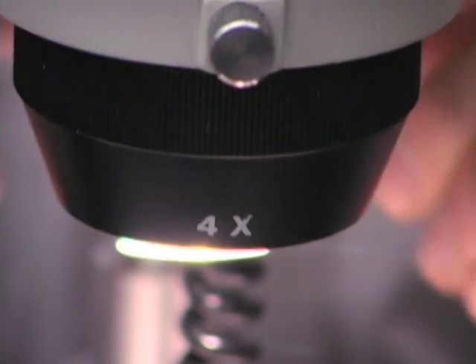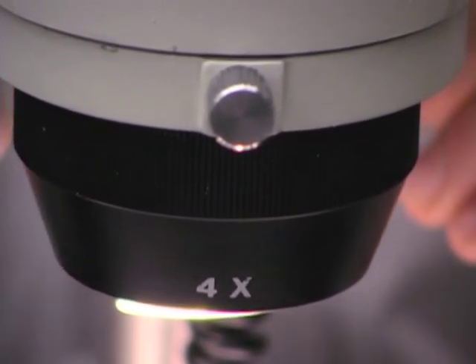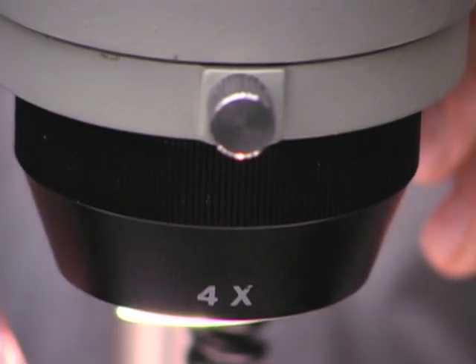Objective lenses seldom need cleaning unless you touch the lenses with your fingers. You should not remove any lens from its housing for cleaning the internal surfaces — leave that for an expert.